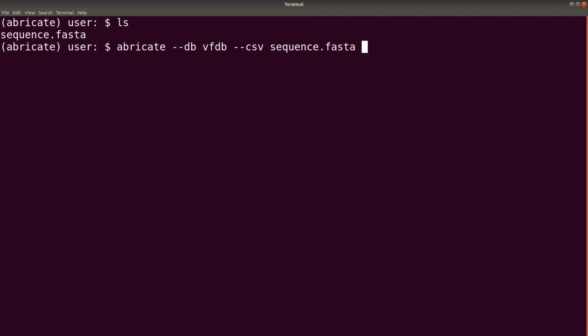Now that we have this command complete, we now save this output to a file. We do that by issuing this command, the greater than command here, and then we indicate the file name which the output should be saved in. So we'll just give it a name. We say factors.csv. Let's put it this way. Okay, so we now have it. Or you can also put a meaningful name there as well.